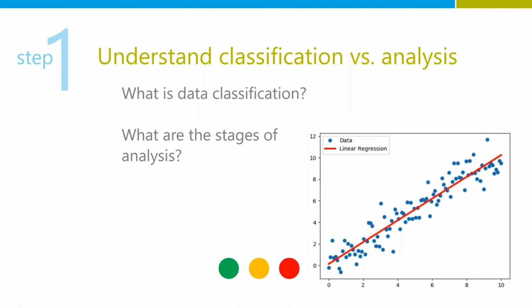Once you have those classifications of the data points, you're going to want to take it further through more stages. So just looking at one individual data point and its conditional state, in our situations, we typically use the red, amber, green methodology to apply a classification to a data point. But once you start looking at all the data points together, you're in your first stage of analysis.